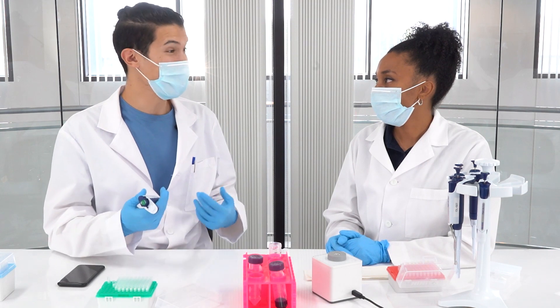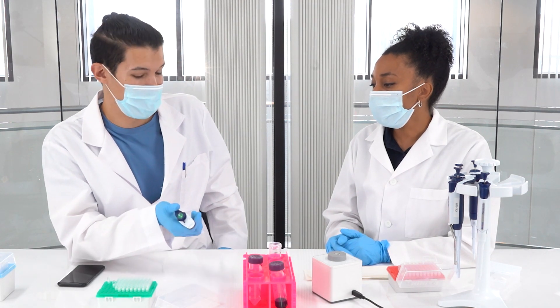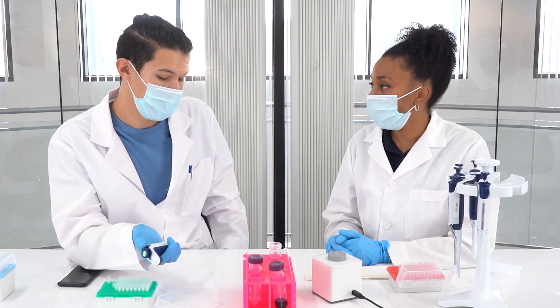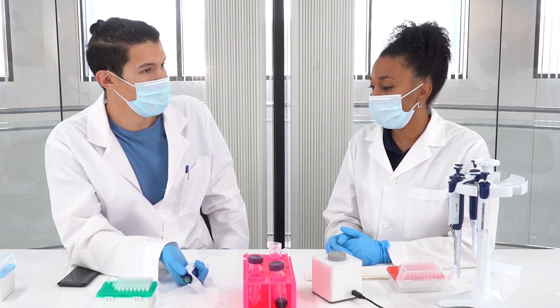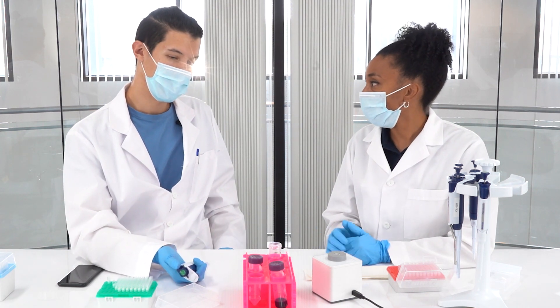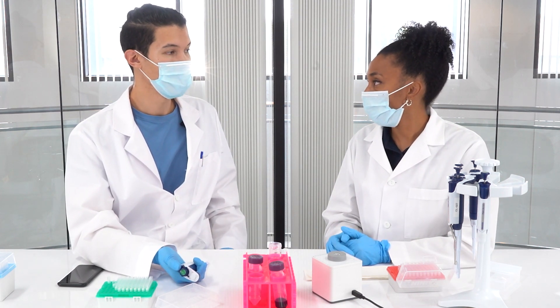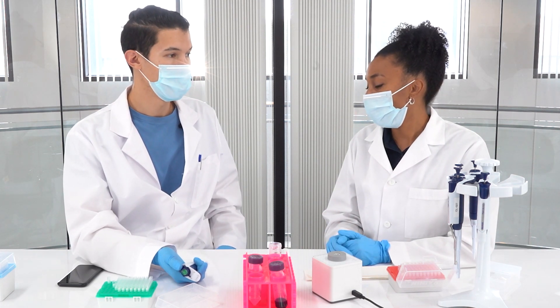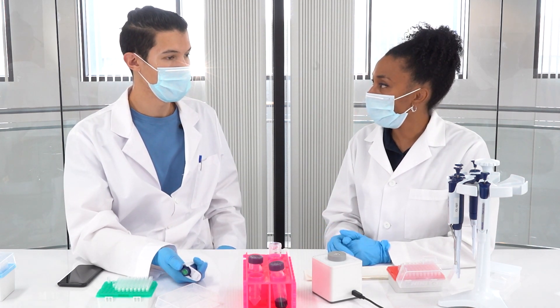So it's probably just my technique, right? It could be, but it's quite challenging for many of us to pipette at a volume that low, especially at the bottom of a volume range. The critical thing is to work on your technique so you fall within the tolerances for your assay. The other critical piece is PipetteX — it will record all your results so you can track them over time.